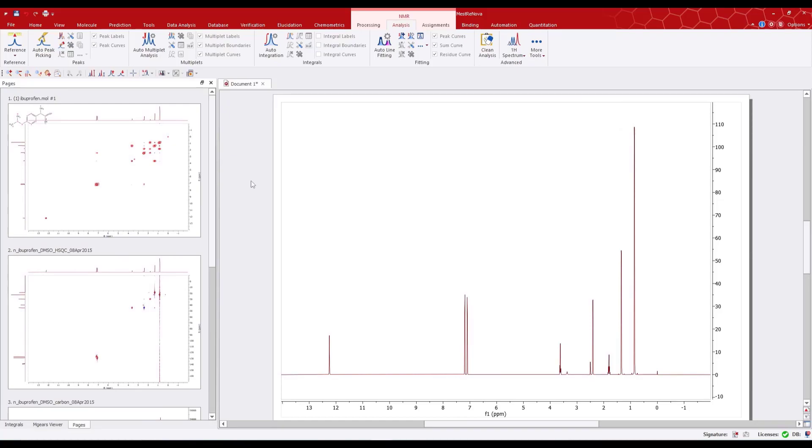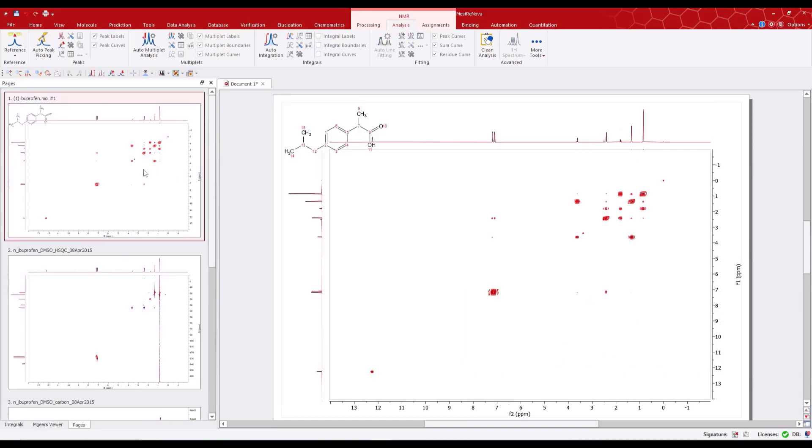If your application requires a molecular structure and there's a molecular structure within the folders, then this is automatically loaded. If the structure file is in the top directory though, it will automatically be displayed with the first spectrum.